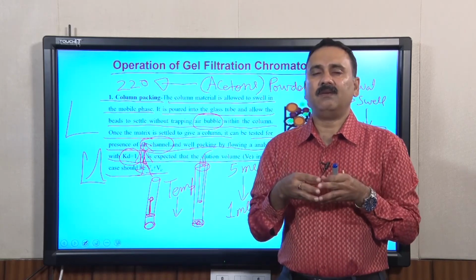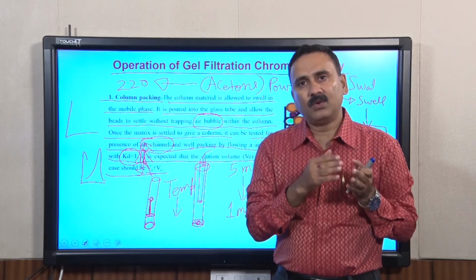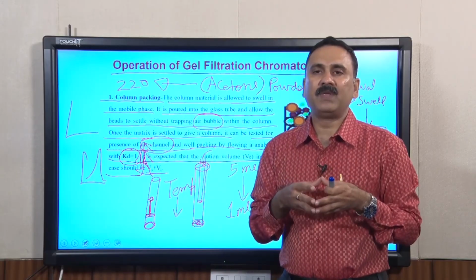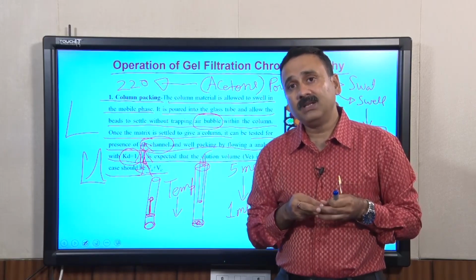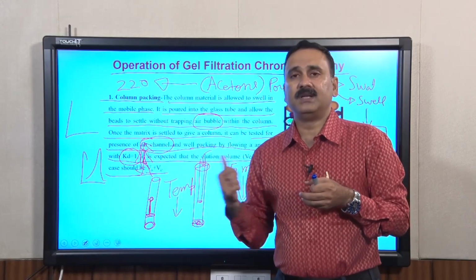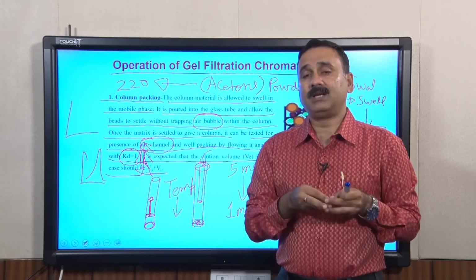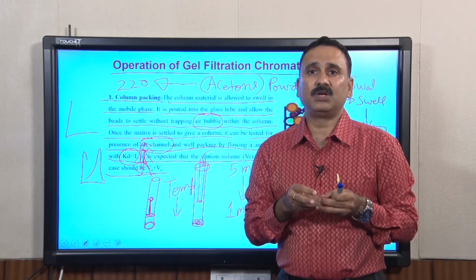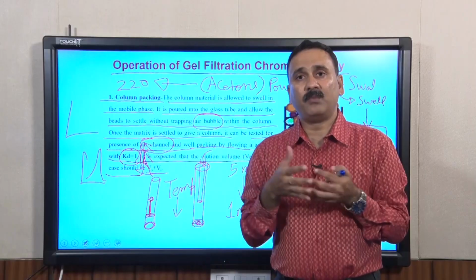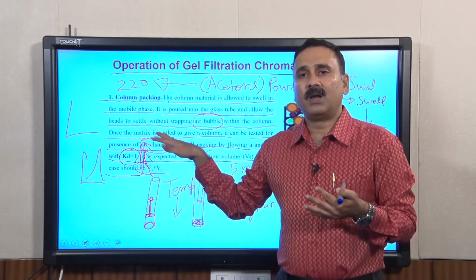To explain this in more detail, we have prepared a demo session where we are going to take you to my lab, and one of my students is going to show you how to pack the gel filtration column, how to determine the molecular weight using different approaches, which we will discuss in subsequent slides, and how you can detect different problems in the gel filtration column, such as air bubbles and air channels, and how to troubleshoot those problems in the column packing itself.